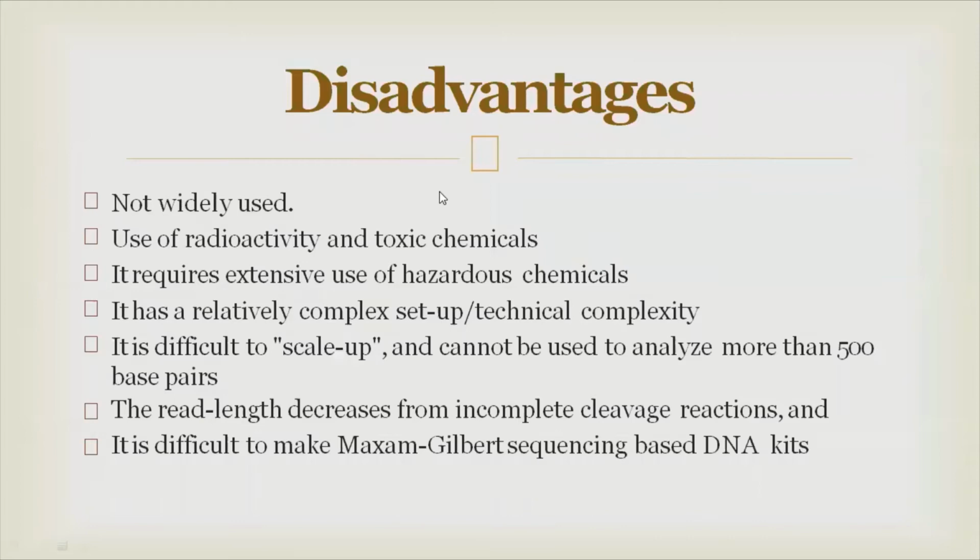Disadvantage: it is not a very widely used method because of the use of radioactivity and toxic chemicals. It can be eliminated by many labs because not all labs handle radioactively labeled materials. It requires extensive use of hazardous chemicals. It is a relatively complex setup, with technical complexities. It is difficult to scale up and cannot be used to analyze more than 500 base pairs, right?